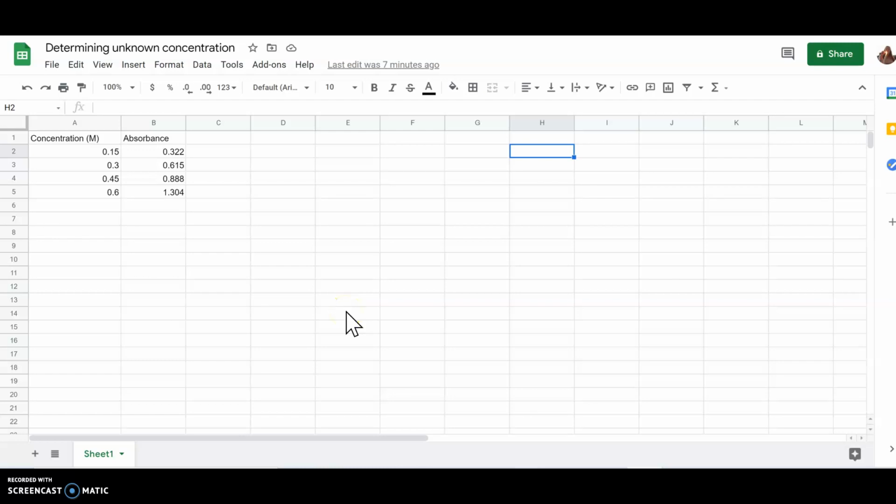Hi, welcome. Today's video is on how to graph our concentration and absorbance data that you took during the Determining the Unknown Concentration lab. This is also a generic video on how to graph using Google Sheets.